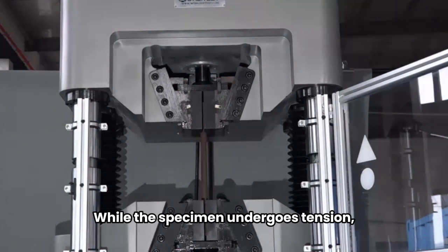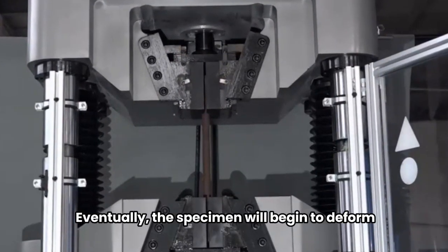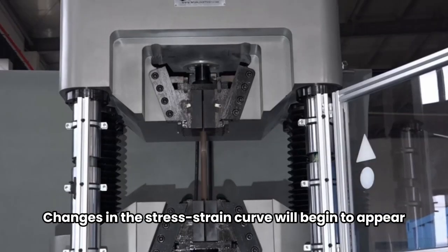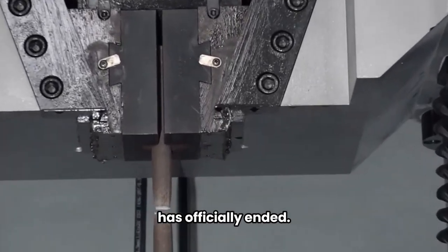While the specimen undergoes tension, the tester can monitor how much elongation is occurring in the process. Eventually, the specimen will begin to deform in the middle of its length. Changes in the stress-strain curve will begin to appear during this phase. Once the specimen breaks, the tensile testing has officially ended.